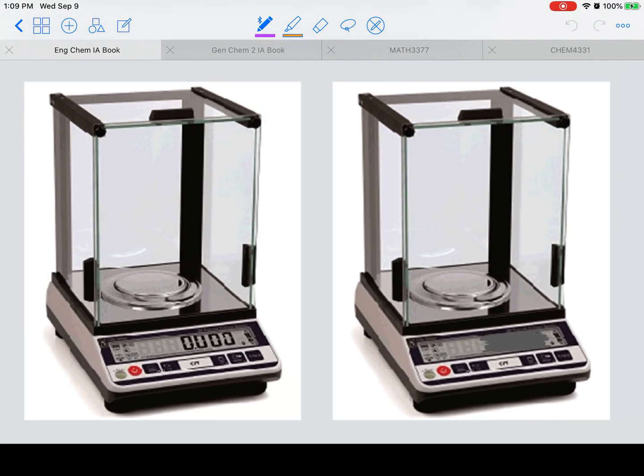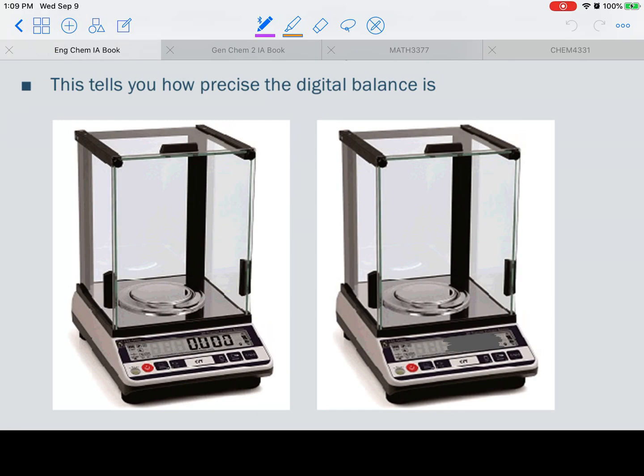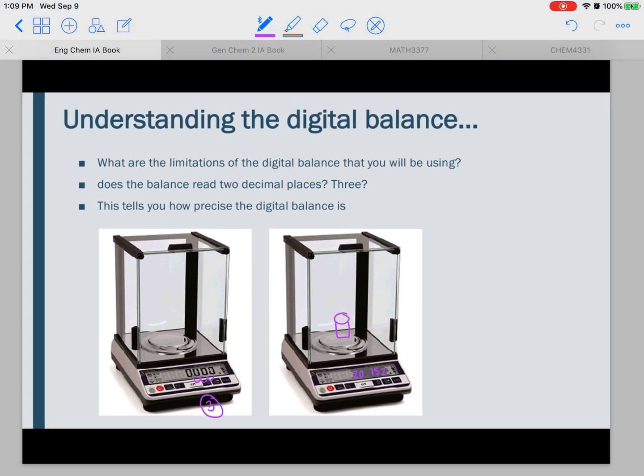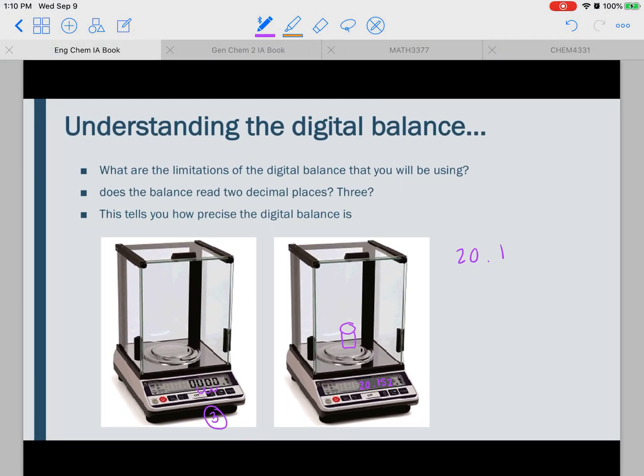So I have these little scales, and I'm just going to do an example. On the scale on the left, it's zeroed out, and you can see that it has one, two, three decimal places. So that means, let's say we weigh a beaker over here, I'm going to put a beaker on the scale, and then the scale says like 20.152 grams. That means in our notebook, we're going to write 20.152 grams.